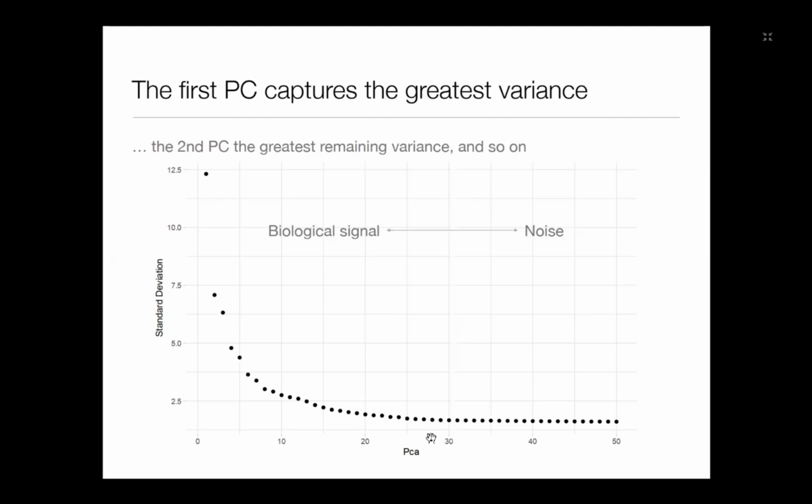What's recommended is that if you're unsure, you take a higher number, so you rather err on the higher side than on the lower side. So you include some noise, but you're not excluding biological signal. That's why I went for 30. And if you look really closely at the plot, you would actually see it because there are some lines missing. So now we have our dataset, 10,000 cells and 30 principal components, and that's what we are working with.